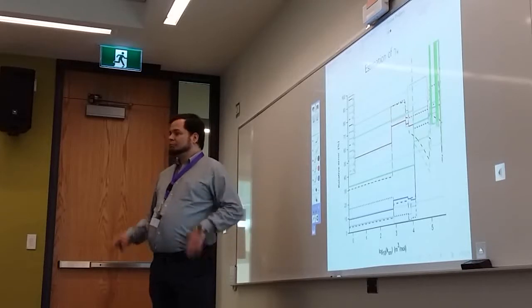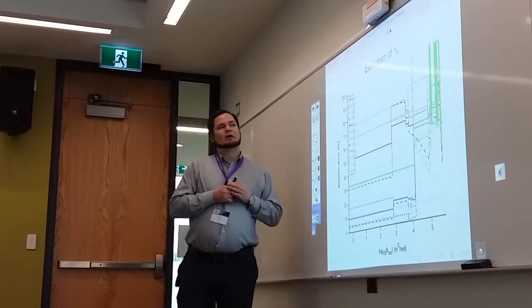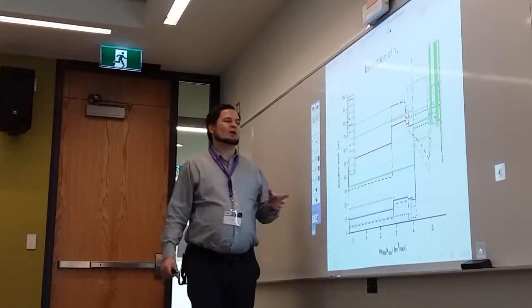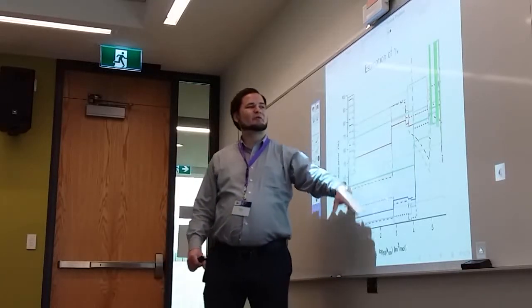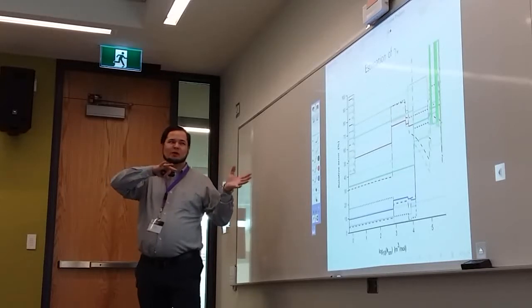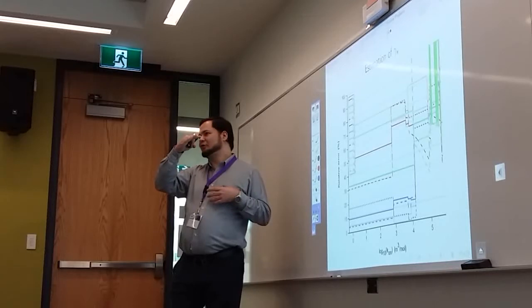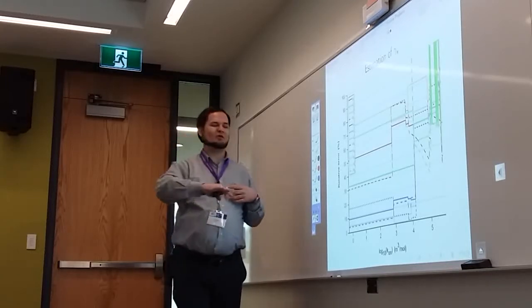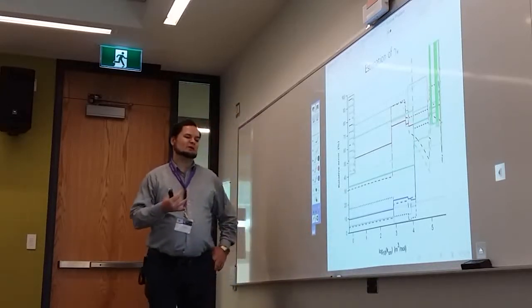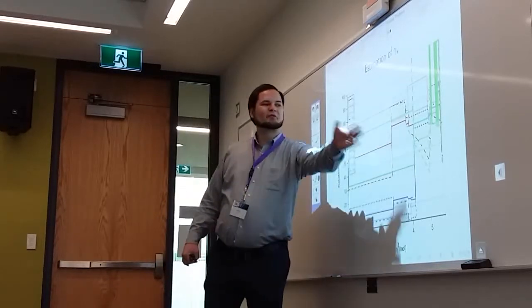That demarcation is approximately where the left peak, the C peak, disappears. In my algorithm, I specified that in order to extract information from the C peak, the left peak, it has to be above about 5% of the maximum of the whole signal. As soon as the left peak falls below that 5%, we start having crazy behavior.